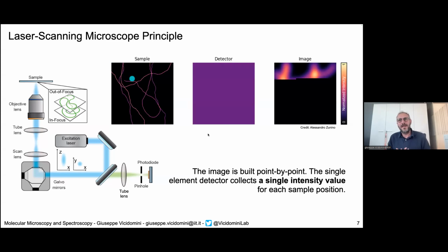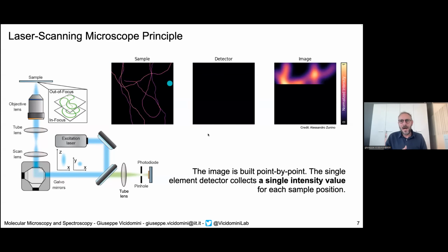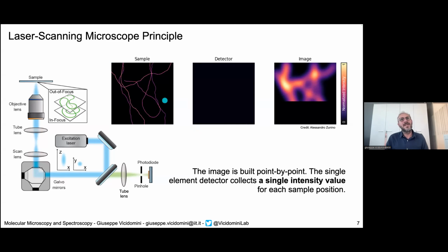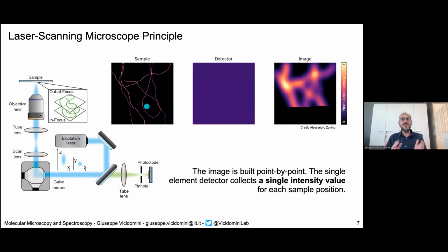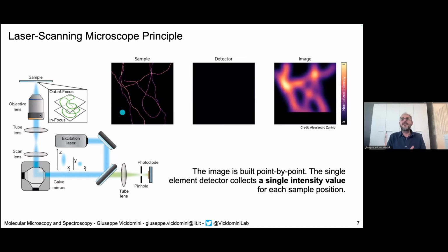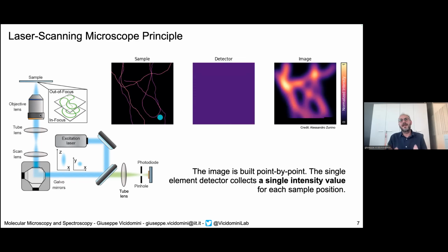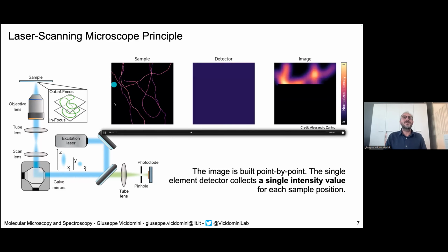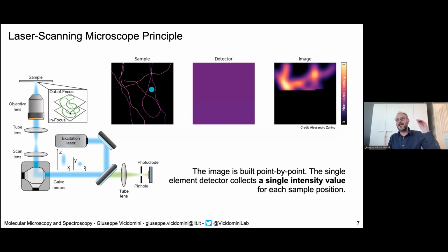But before, I need to explain a little bit more about confocal microscopy and what its limitation is in terms of super resolution. It has been already mentioned before by Sabrine. In a confocal laser microscope, you take a laser beam and use an objective lens to focus it on your sample in order to generate a very tiny region to probe. That is typically diffraction limited, let's say on the order of 200 nanometers. The fluorescent molecules in this region will emit light that is collected by the same objective lens. Then this light is projected onto a photon sensor, typically a photomultiplier. At the end of the story, we focus the light on a point and we register a single intensity value. So we measure the light that is coming from this region.